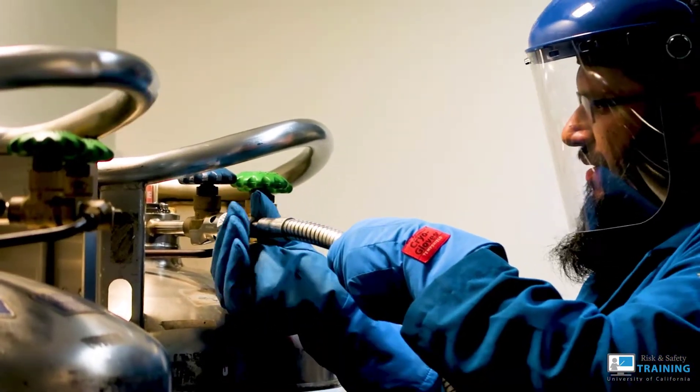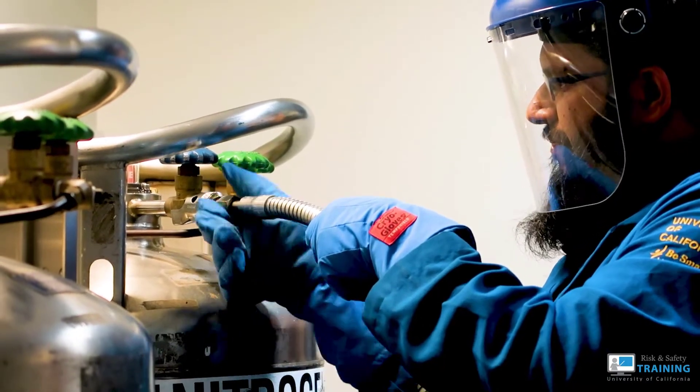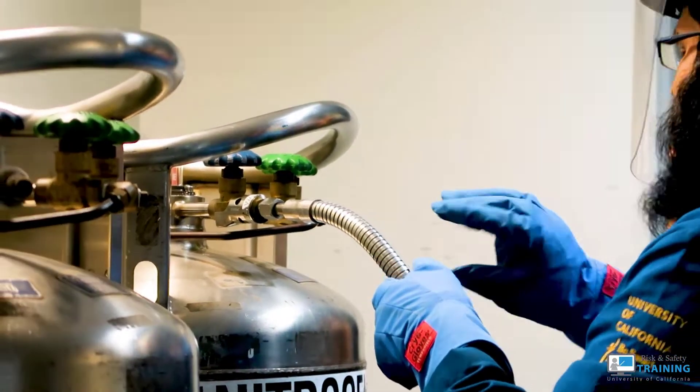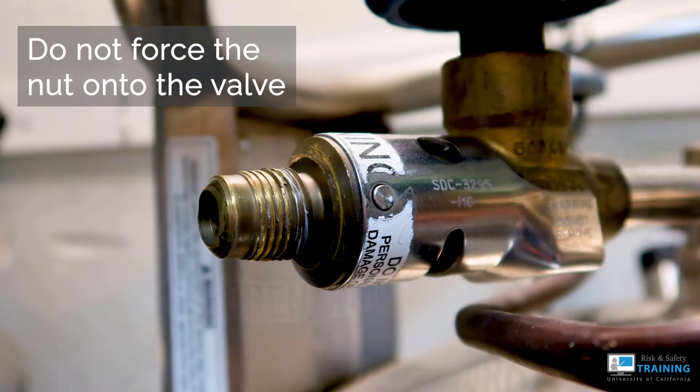If you are having a hard time attaching, stop, loosen it up, and adjust the nut onto the valve. The problem with forcing the valve nut on incorrectly is that it will cross-thread, resulting in damage to the threads which could cause permanent leaks.